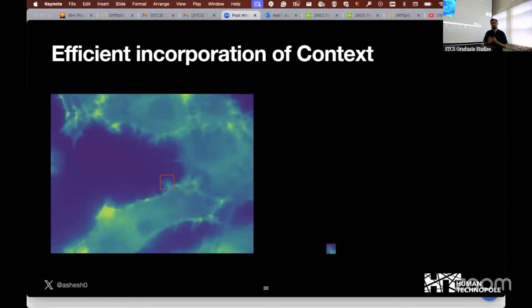Yes. So your training data is acquired using the classical ways on confocal? Yes. And just for my clarification, if I would have missed that, you are using the data which has used only a single fluorophore or multicolor? Multicolor. Okay. So in the context of the emission spectra, how is this going to help resolve the superimposition? So you will get a superimposed image, right? Okay. You will get it. And then we will use deep learning to split the superimposed image into individual constituents.